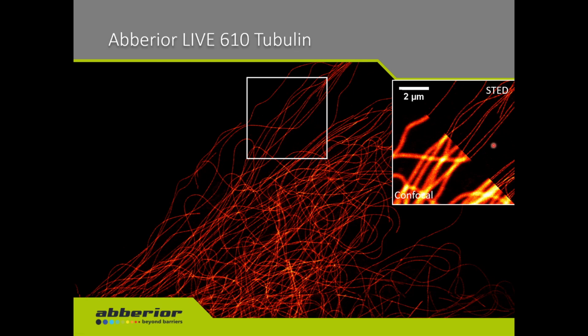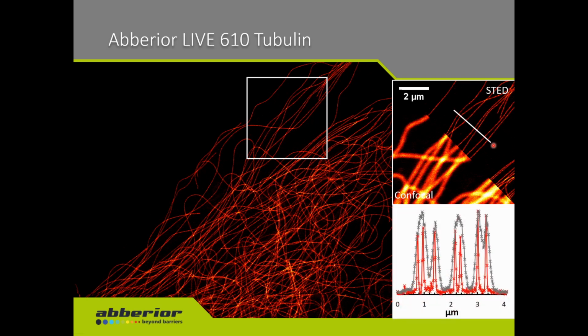If we draw a line profile, then we see each and every single tubulin filament in STED microscopy, which is not possible with confocal microscopy, shown here in gray.